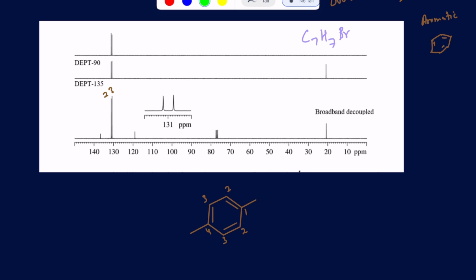Well, what else do we have left going on? We have a bromine, and another carbon. So we have 1, 2, 3, 4 hydrogens already taken care of. There's no hydrogen here, and no hydrogen here. So that means I have 3 more hydrogens. So possibly I have a CH3 group, and then a Br here. It doesn't matter where you put the Br or the CH3, it's the same thing.